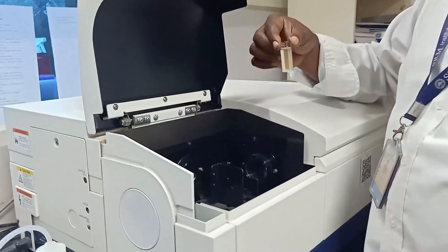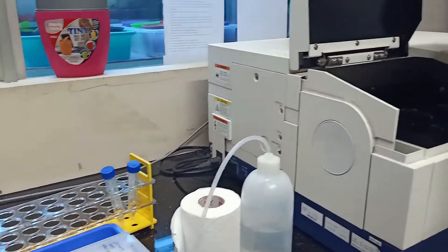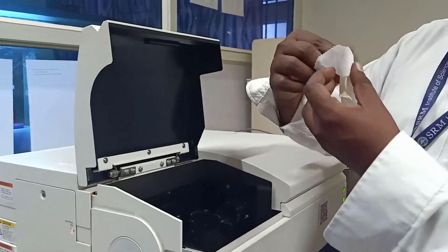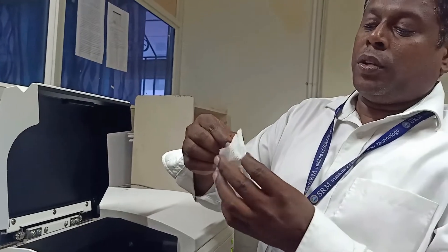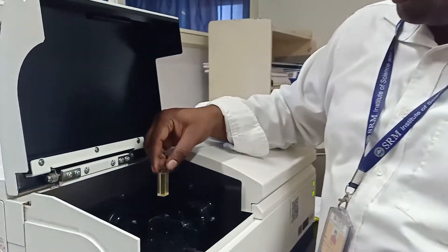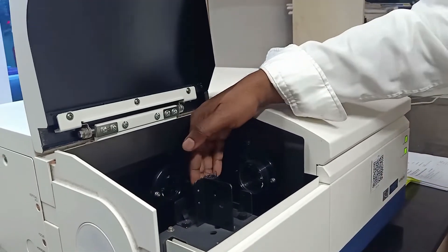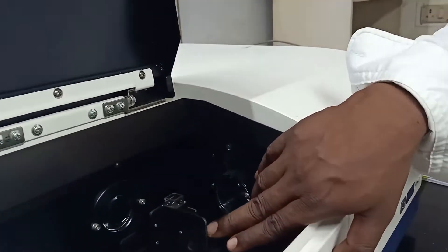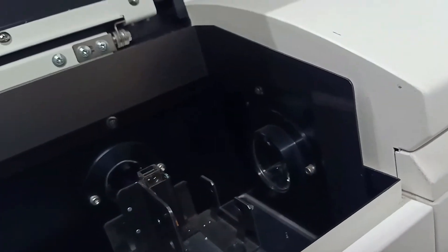Make sure everything is clean. You have to clean the cuvette on all four sides, because even small scratches or dots are going to interfere with your fluorescence measurement. I place this in the sample holder and you can see the fluorescence light hitting the sample.